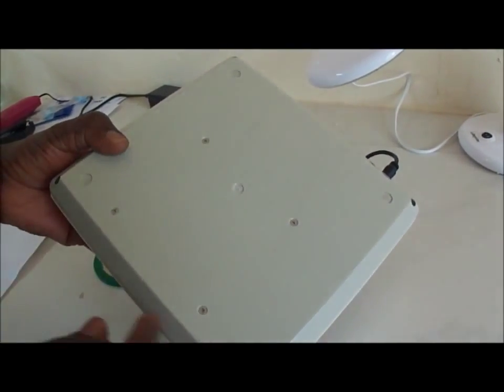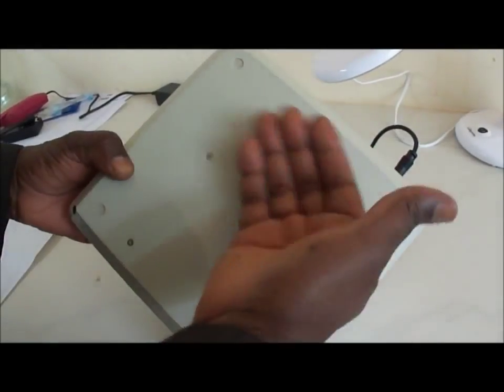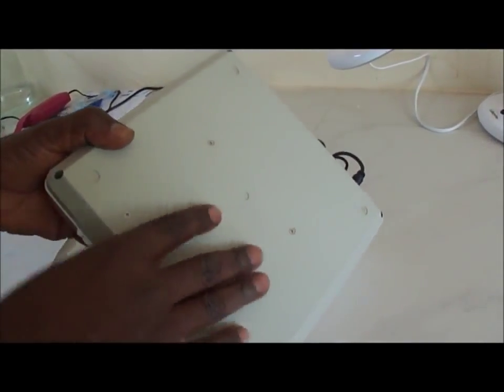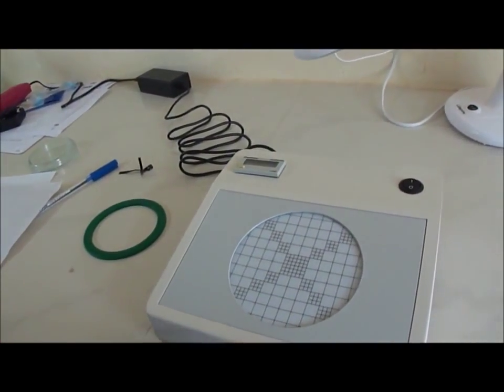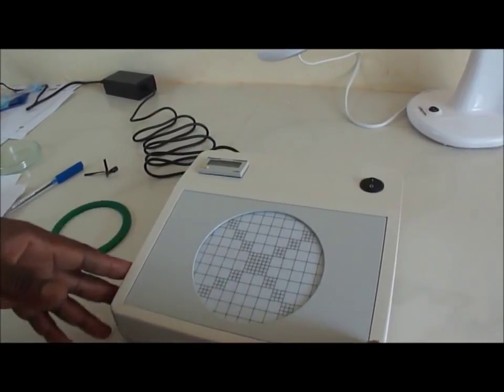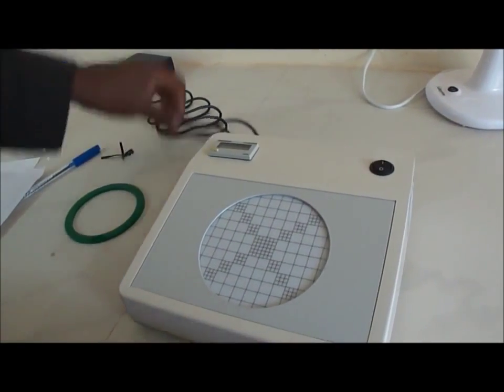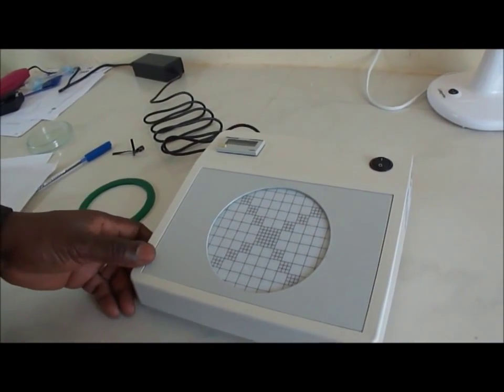At the back you have 4 screws. If you remove these screws, 4 screws in the middle here and 4 others here, and remove this cover, you will find a battery. This battery can be replaced easily by ordering them. But before you can use the battery, it has to be charged. So you have to leave the device connected to the electrical circuit for a while.